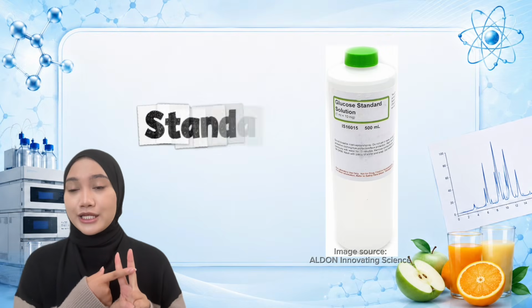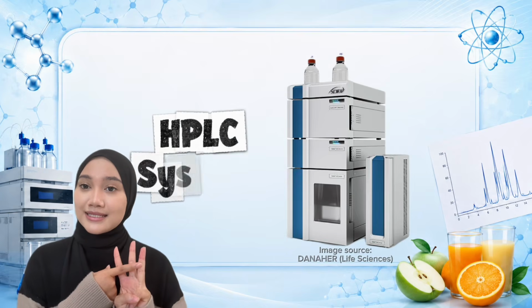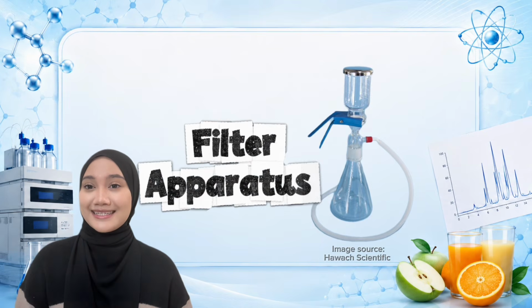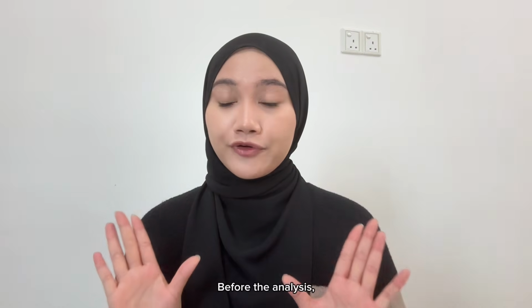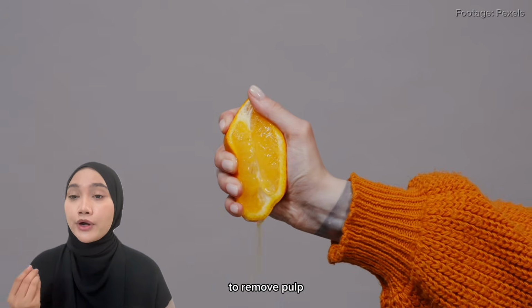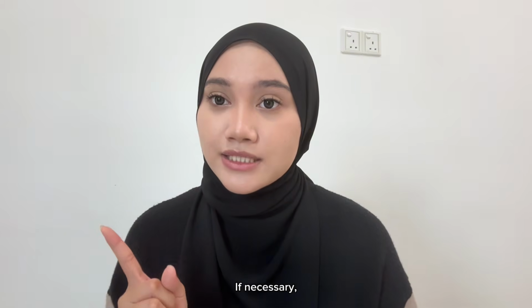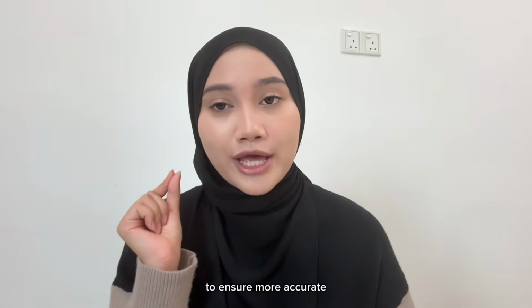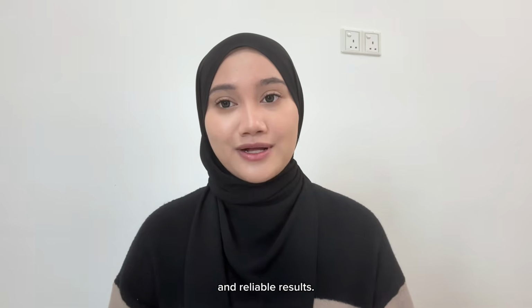These include apple juice and orange juice samples, standard sugar solution, HPLC systems, the mobile phase, and a filter apparatus. Before the analysis, the juice samples are filtered to remove pulp or other impurities. If necessary, the samples are diluted to ensure more accurate and reliable results.